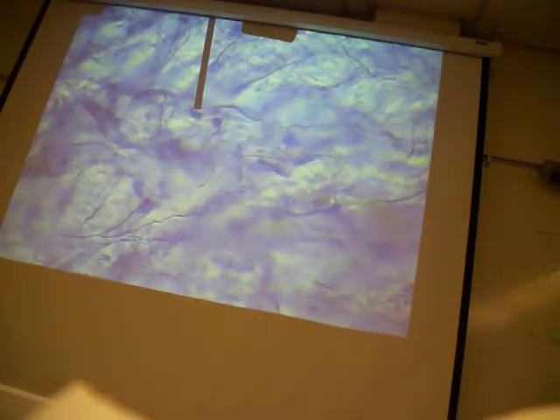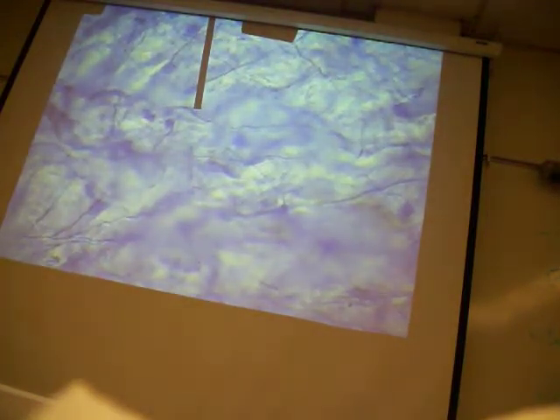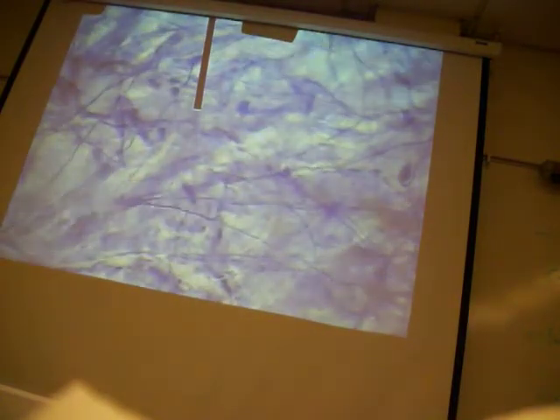Now, the fibers, you see these dark fibers right here? That dark fiber right there is elastic fiber. The protein in there is elastin. Stretchy: stretch it out, it's going to give a rebound. The collagenous fibers are these darker, thicker purple ones. See these thicker purple ones right here that are kind of wavy.